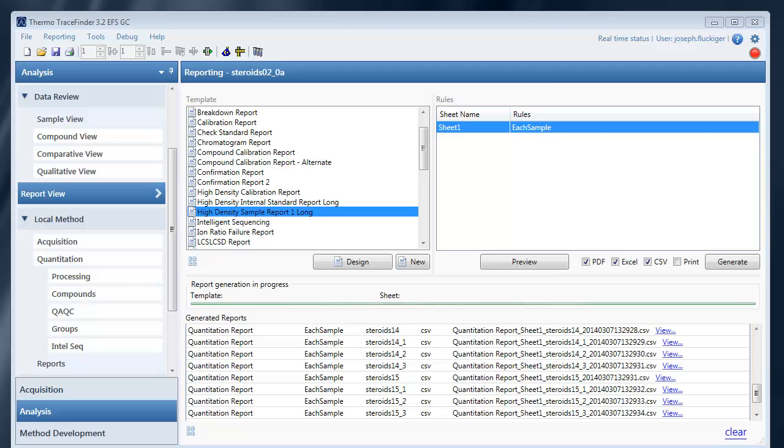Hi, my name is Joseph Flukiger and in this tutorial I'm going to explain how to design a template in TraceFinder 3.2 in the new reporting engine which is spreadsheet based.